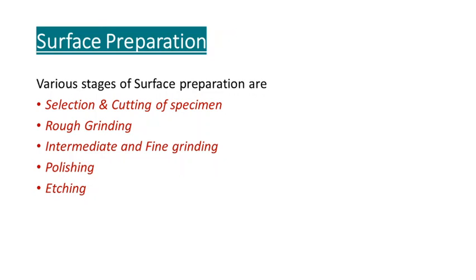Good morning all. In the last class we discussed the characterization of crystal structure using X-ray diffraction techniques. That is one particular class of characterization tool: X-ray diffraction phenomena, the X-ray diffractometer. In this class we will be discussing microstructural characterization and the requirement of microstructural characterization.